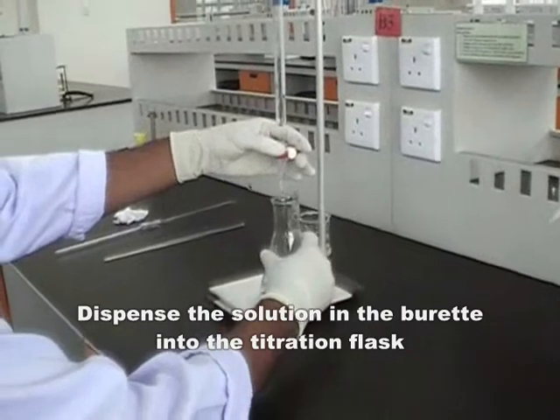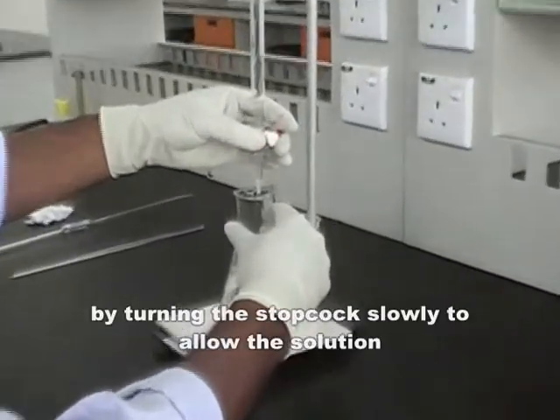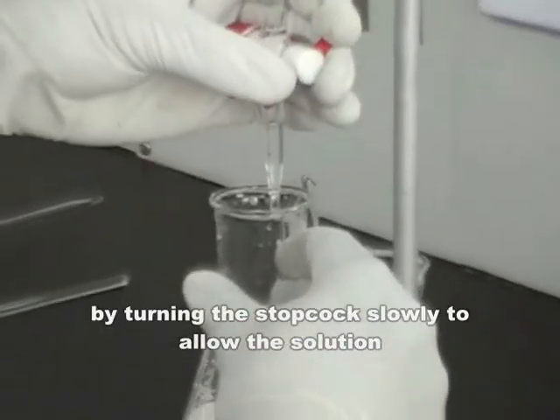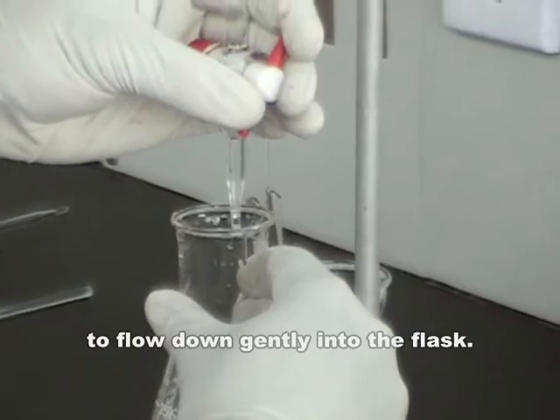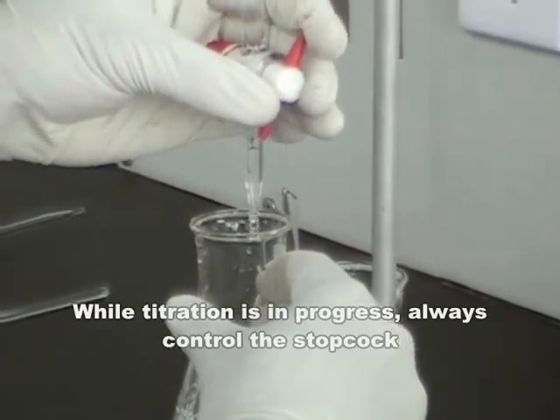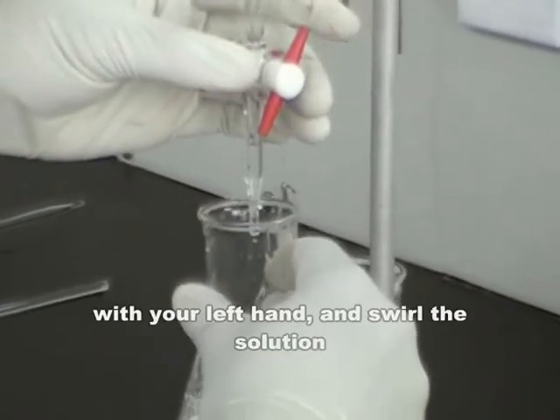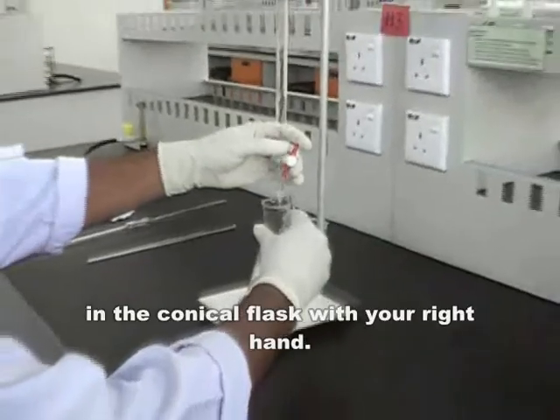Dispense the solution in the burette into the titration flask by turning the stopcock slowly to allow the solution to flow down gently into the flask. While titration is in progress, always control the stopcock with your left hand and swirl the solution in the conical flask with your right hand.